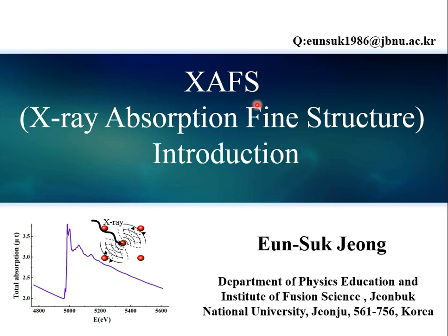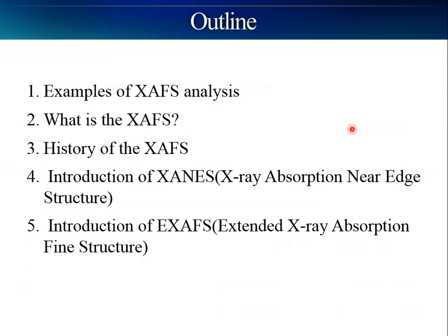Okay, the first lecture topic is XAFS introduction, which refers to X-ray absorption fine structure. Let me give you the outline of this lecture. So first, some examples of XAFS analysis will be introduced. As you know, there are many tools to investigate materials such as SEM, TEM, XRD, and FTIR. However, you can understand the unique characteristics of XAFS to examine the materials from these examples.